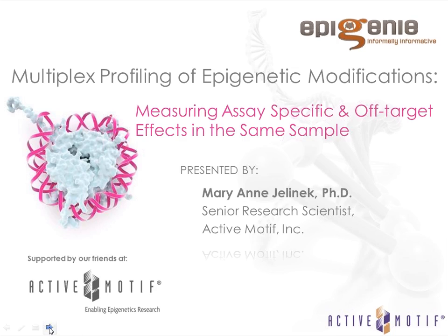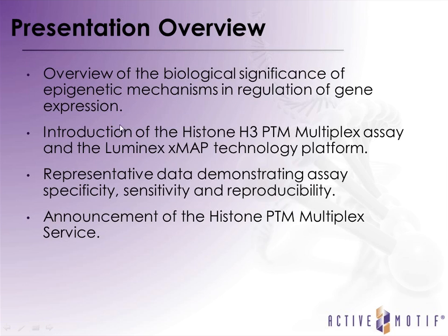I will start with a brief overview of what I will be covering today. I'll start with the requisite introduction of epigenetic mechanisms and how they pertain to the regulation of gene expression. I'll then introduce the Histone PTM multiplex assay that we've developed and the Luminex XMAP technology on which it's based.